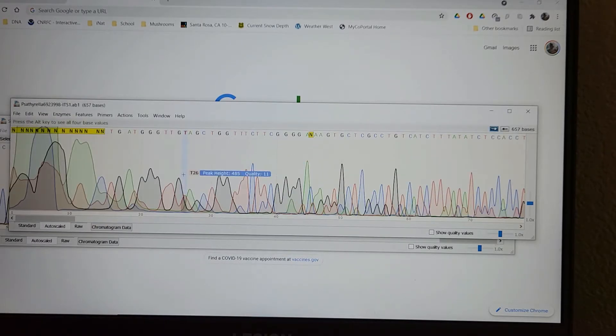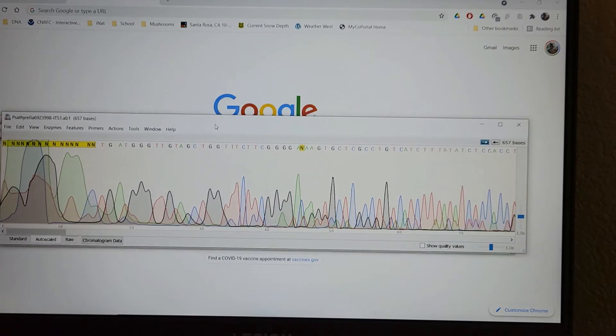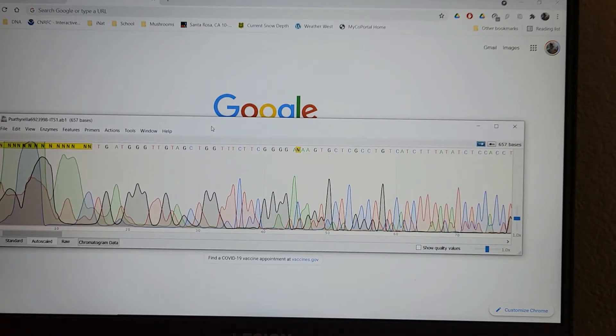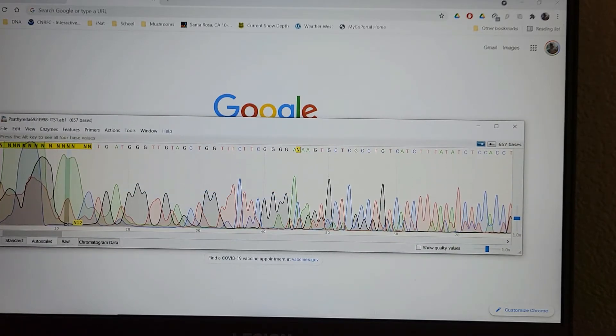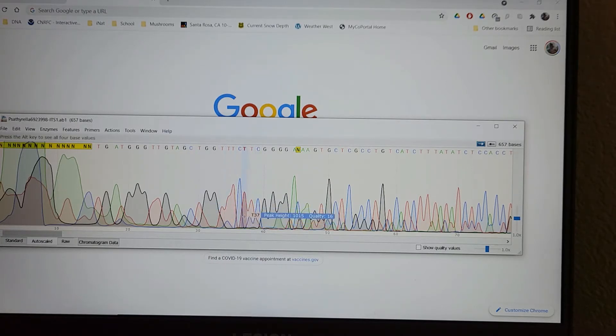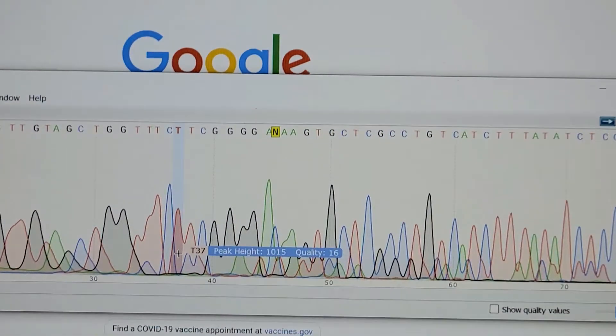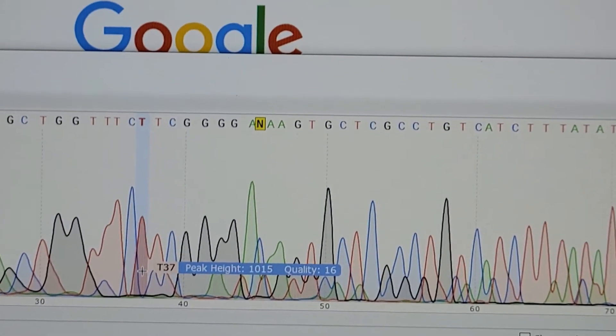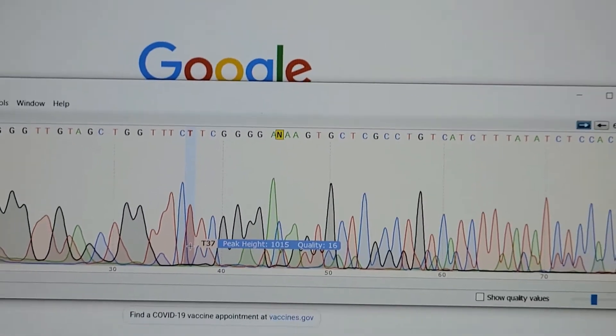So here's an example of a bad sequence. So this is Satharello that I did, and you can see that the sequence is just completely contaminated with all these small peaks. You zoom in, look at the quality score. The quality score is just 16.